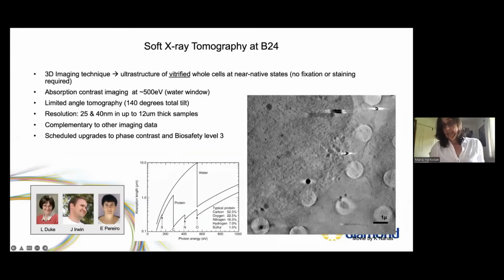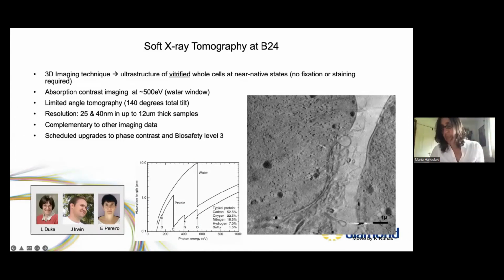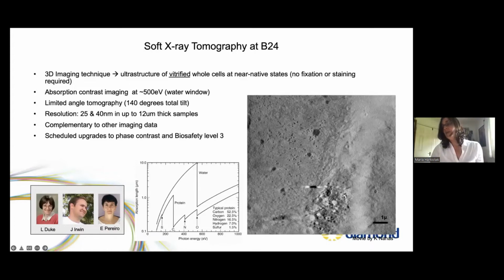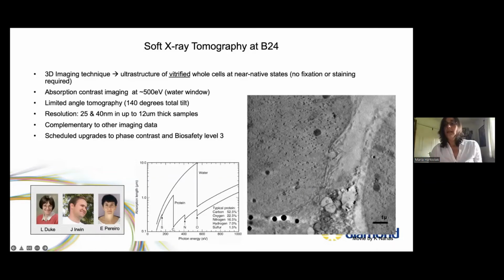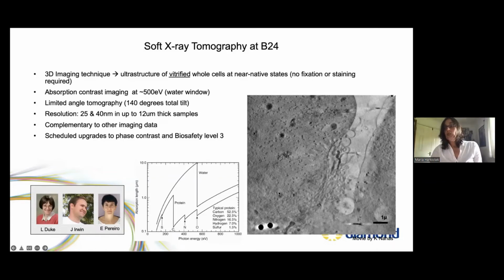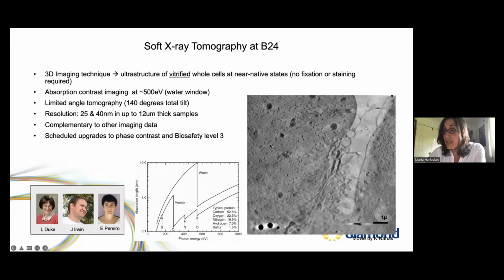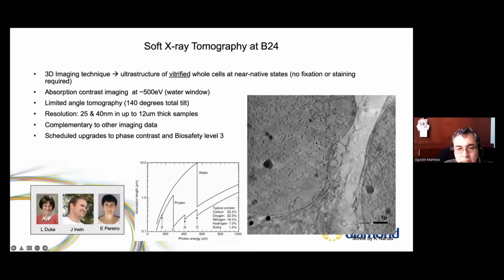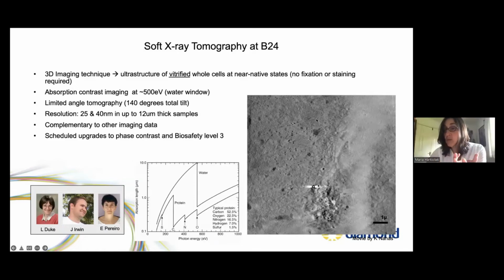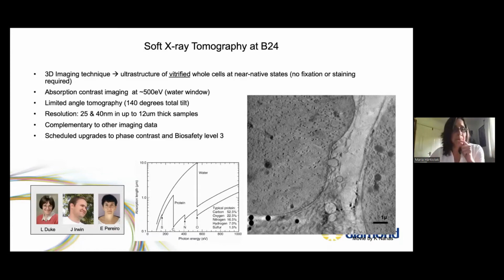And what you can see here is actually our field of view, how much we can see. There are two cells here. There's a nucleus top left, and there's a nucleus right at the bottom. And these two cells are in contact here on the side. And each nucleus that you see here has lots of dark spots. These are actually herpes virus capsids. It's one of my students' projects. And it gives you an idea of the resolution you can expect. And of course, this is imaging through the volume of a fully vitrified and fully infected, in this case, cell.